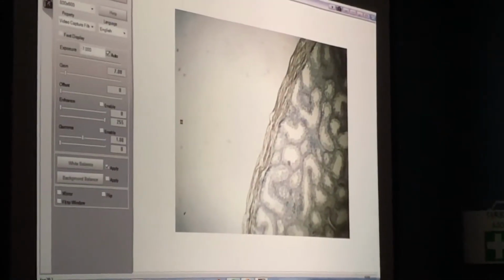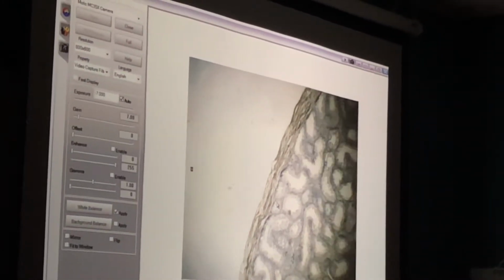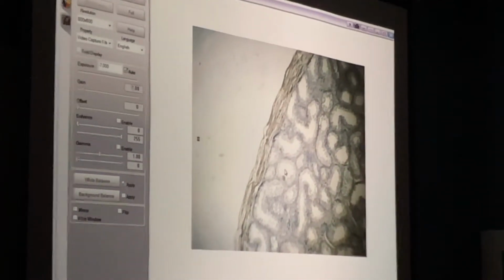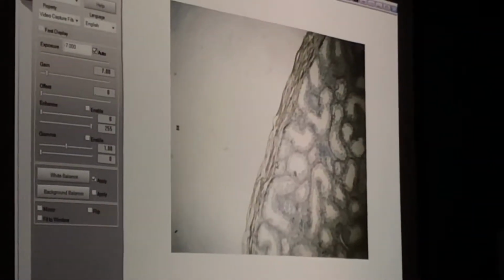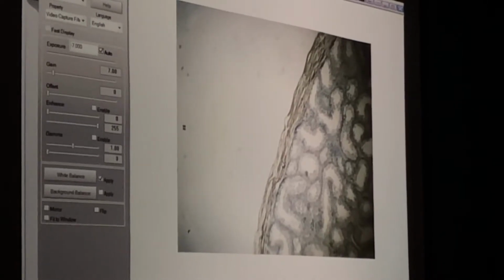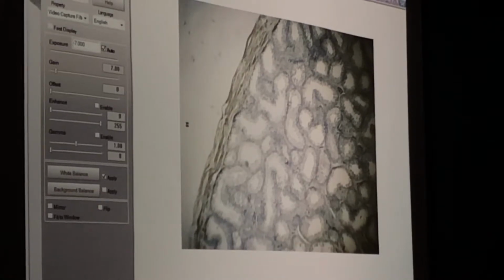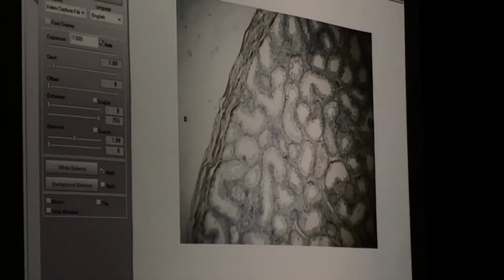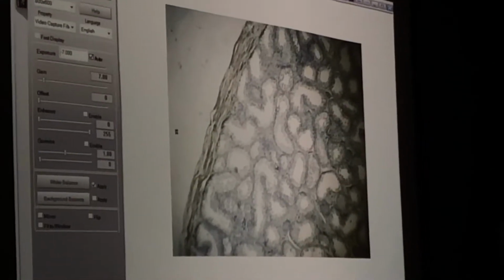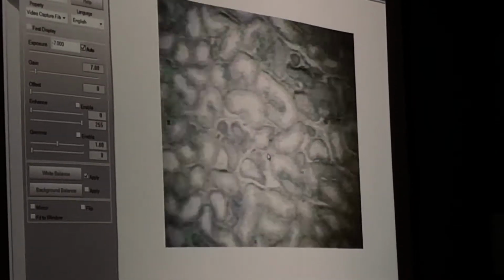Here, I'm going to have a covering over the testes, so that's probably going to be what? Tunica. It could be, but it's probably the inner one. Albuginea, yeah, probably the tunica albuginea. Now remember, in human testes, because they're bigger, the albuginea makes little depressions in and separates the testes into lobes or segments, and so they have septa. The little mouse testes don't have any.